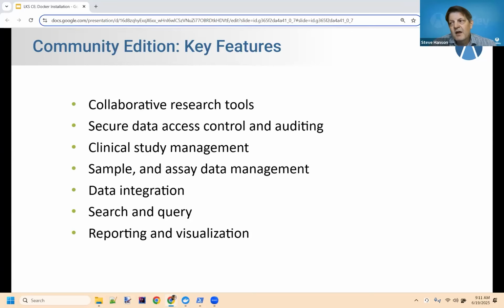Again, I could keep going, and honestly, a natural sequel to this slide would be to go look at some of my server administrator and user trainings, which are available over on our YouTube channel. If you just go to YouTube and search for LabKey, you'll see a whole bunch of videos. But look for the LabKey server or SDMS admin trainings as a sequel to this.